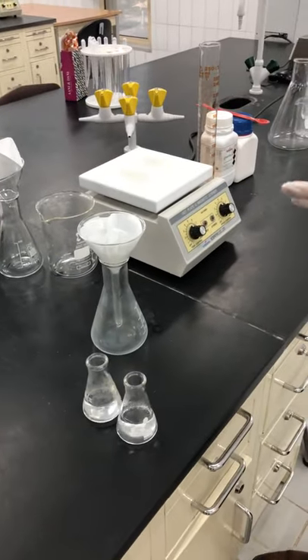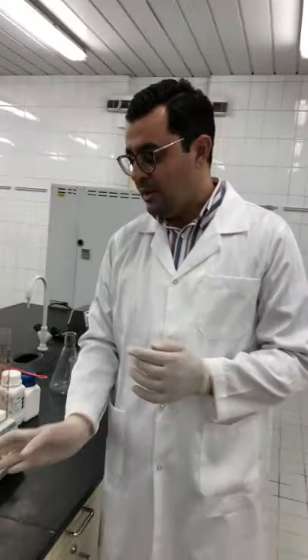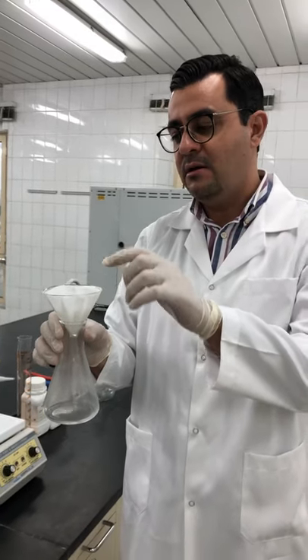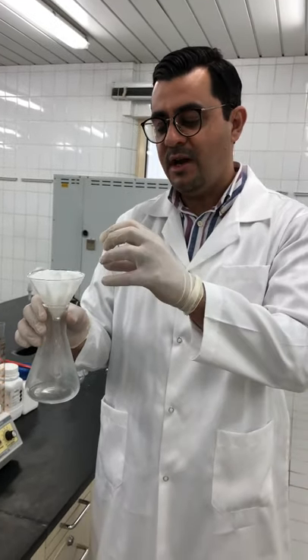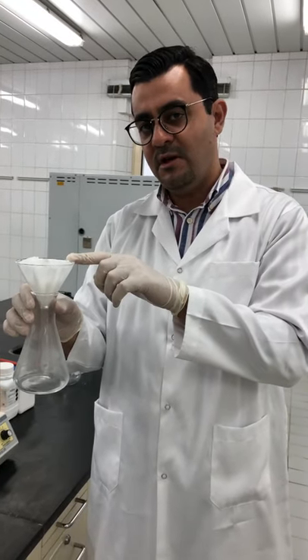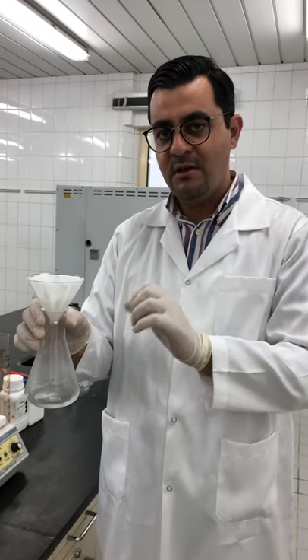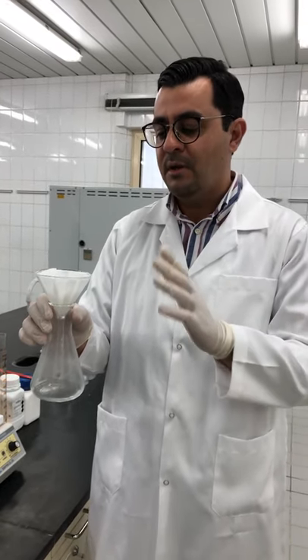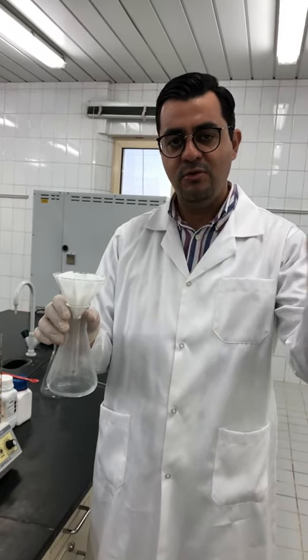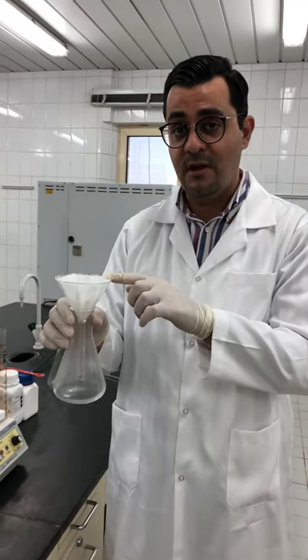Now we'll wait until filtration is over. After that we will dry the filter paper, then re-weigh it and subtract the mass of the empty filter paper to get the mass of the precipitate, which is barium phosphate. Keep this mass recorded because we will use it in the calculation part.